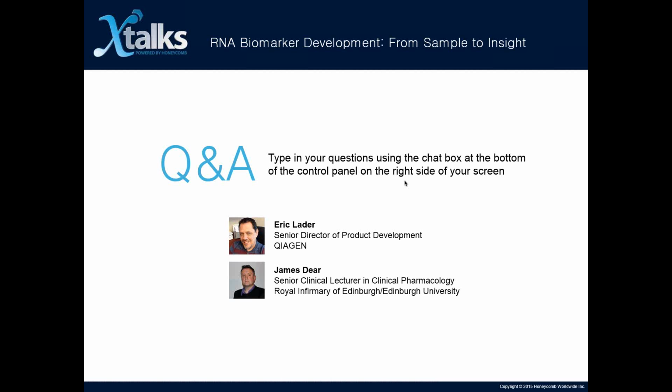Yeah, I'm not sure what the answer to that question is. I think the beauty of copies per microliter is it does allow you to go across platforms and compare the readout you get. Whereas if you normalize to something else, that gets a bit more tricky. But I agree, I don't know what the answer is. For clinical use, as a group, we need to come to some kind of decision, because at the moment, in every paper, everyone measures it in a different way.